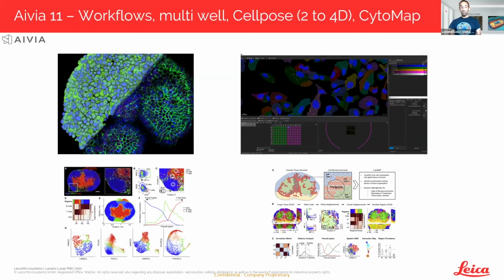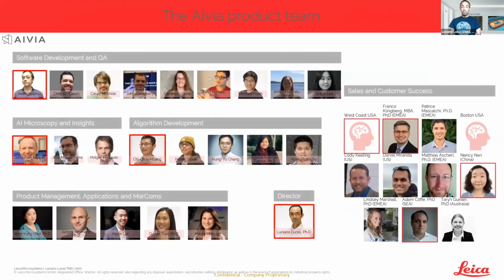And also now a connection to CytoMap, which is a really great tool to make some of the more advanced, exciting charts like UMAP and t-SNE and other clustering algorithms and then charts.